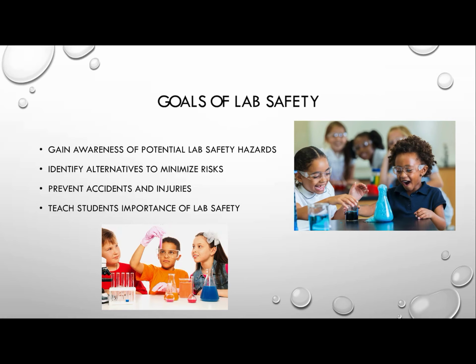The more that you teach them, the less they have to be taught by you every single time you repeat an experiment with a specific chemical or a specific piece of equipment, but you are still in charge of all of the lab safety, but teaching them is really the long-term goal so that they understand. So if we're looking at these 2 images here, we have 2 young ladies working on what looks like kind of an elephant toothpaste type experiment. They both have goggles on. Their hair is both pulled back away from their face.